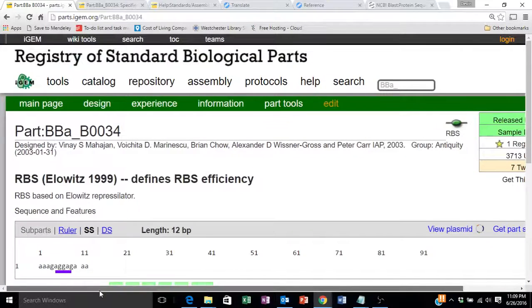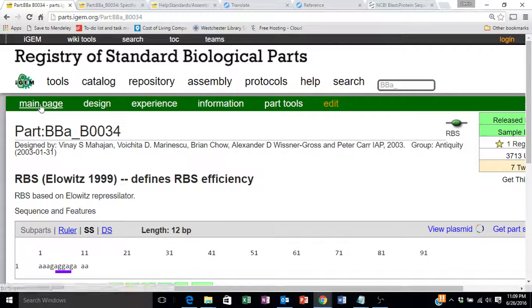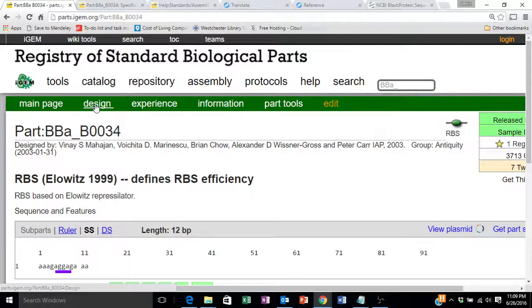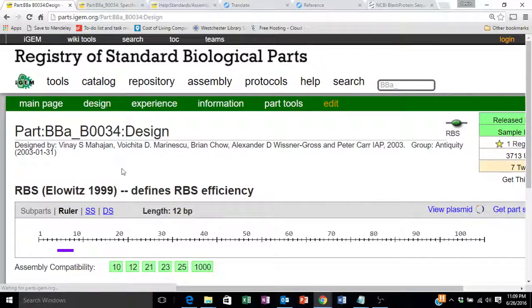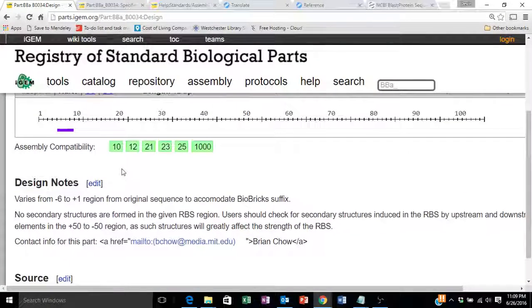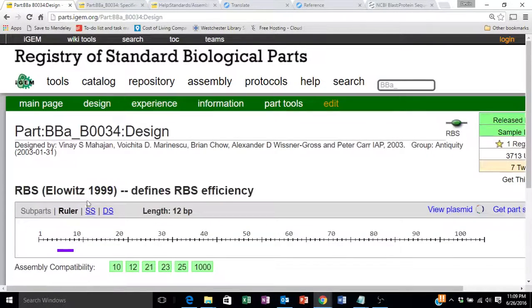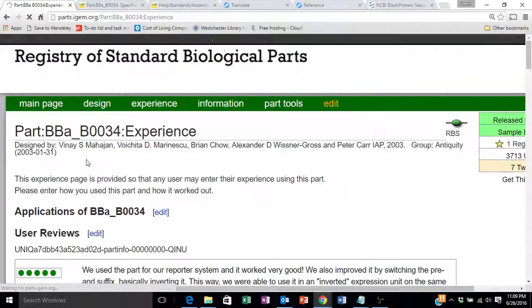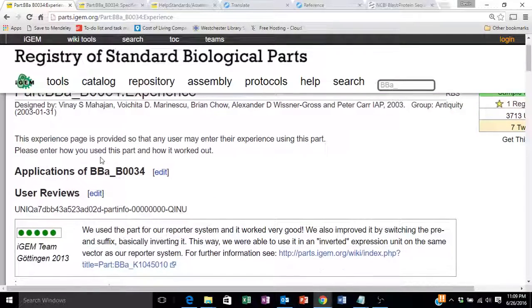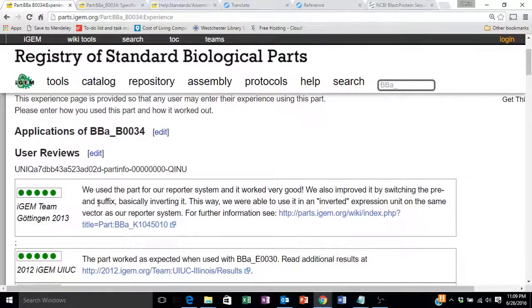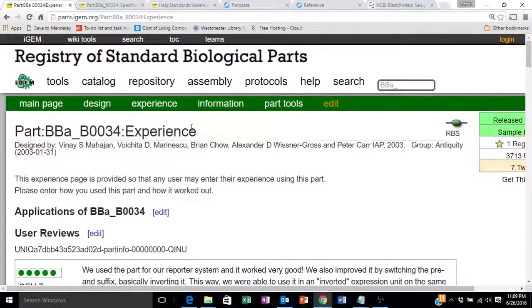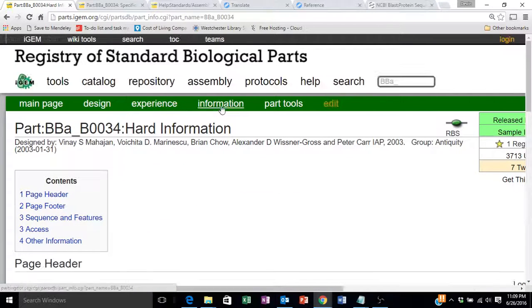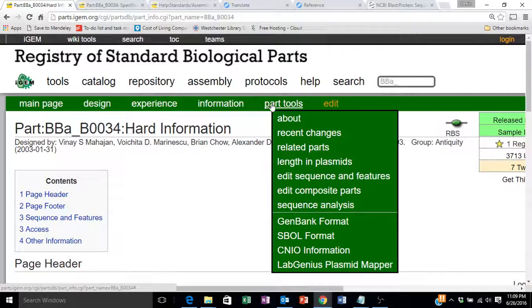In addition, any part page will have not only the main page, but a page talking about the design of the part, some design notes, any experience that people have reported using this part, user reviews essentially, and any additional information or part tools.